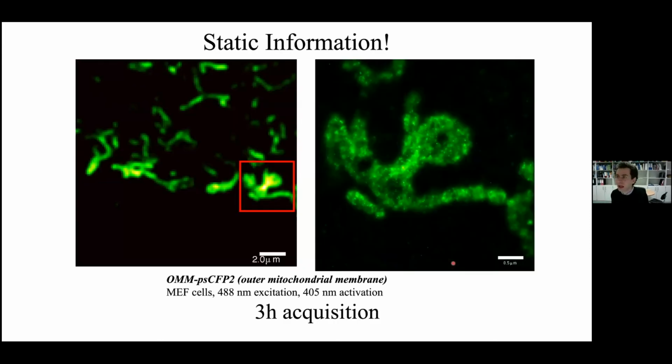So I was saying, out of direct experience, the catch is the fact that this type of approach to imaging is extremely slow. So these are the diffraction-limited images of some mitochondria near the plasma membrane of a cell, and this is the detail of a super-resolved mitochondrion. You can see that here you don't see anything. Here you see that the mitochondrion actually curls around, and you can distinguish it as a specific organelle and feature. The question is that to acquire this image, which is not even, let's say, the state of the art, took about 3 hours. Now, the technology has clearly developed, and now one can do this much faster.